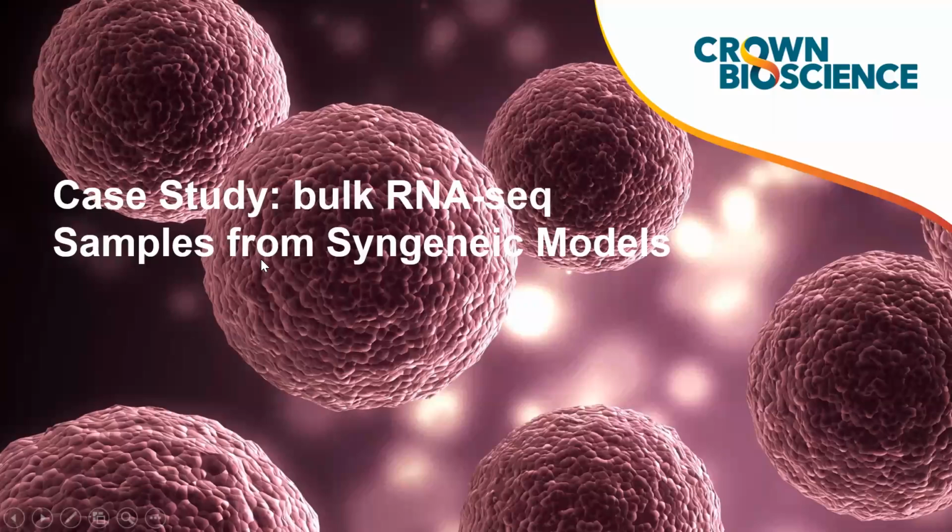In the next 10 or so minutes, I'm going to share with you a case study that we did using a bulk RNA-seq dataset of syngeneic tumor models. These are allograft tumor models derived by engrafting mouse cancer cell lines into immunocompetent mouse strains with matched genetic backgrounds. The sequencing library was prepared by poly-A capture, which enriches for polyadenylated messenger RNAs.